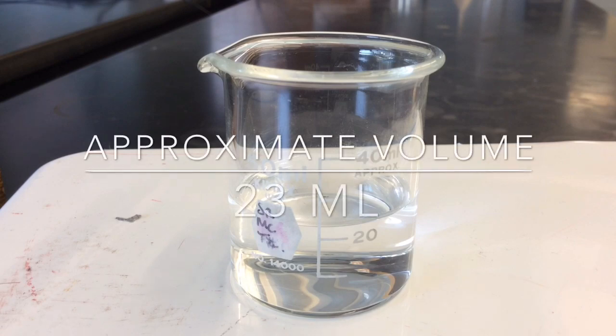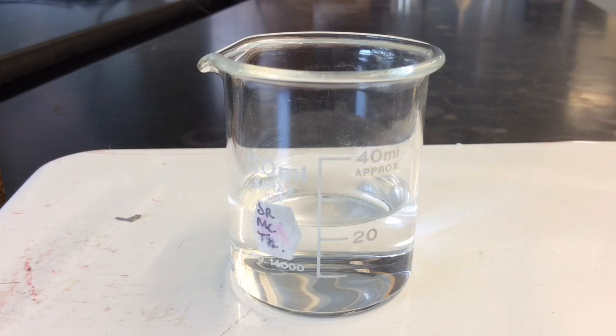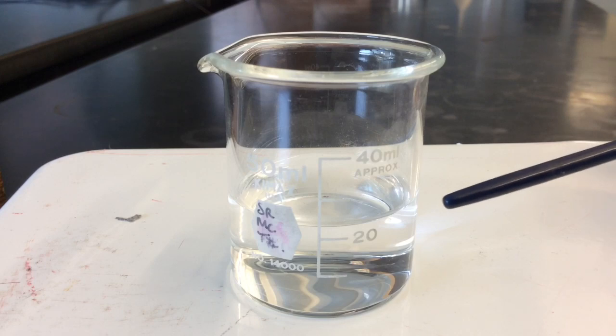To me, this beaker appears to hold 23 milliliters of liquid. To my lab partner, the volume may appear to be 24 milliliters of liquid, and another person could read this volume as 22 milliliters of liquid. We would all be correct. A beaker is only precise to the ones place.